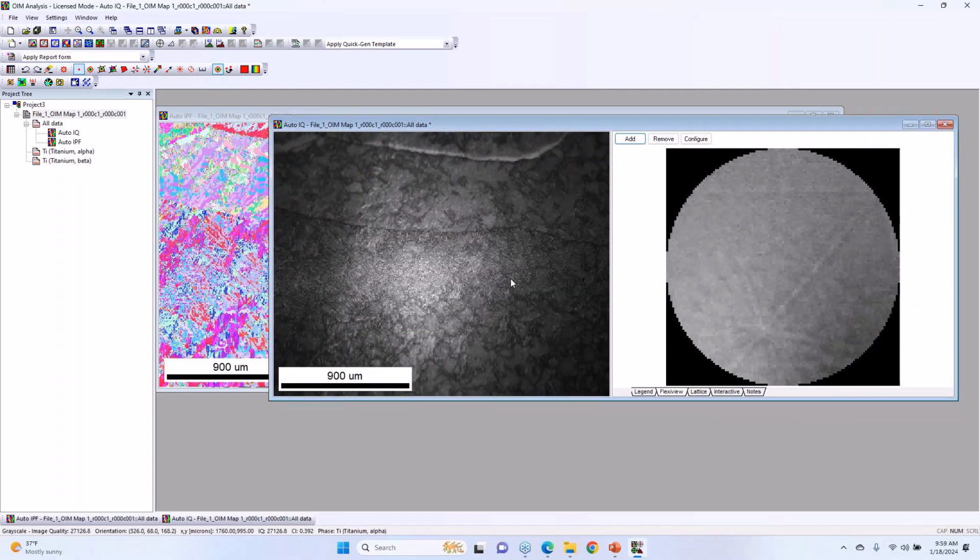It's more just if you put together a stitched image quality map, everyone's going to ask you questions and say, why does it look like that? And you have to explain it. And the other thing, when you're looking at this, we're looking at a tilted sample, a projection of the area. So you can start to get some trapezoidal projection with a tilted sample.